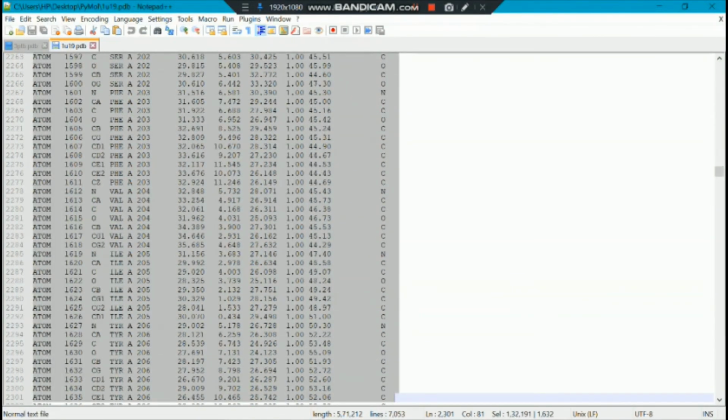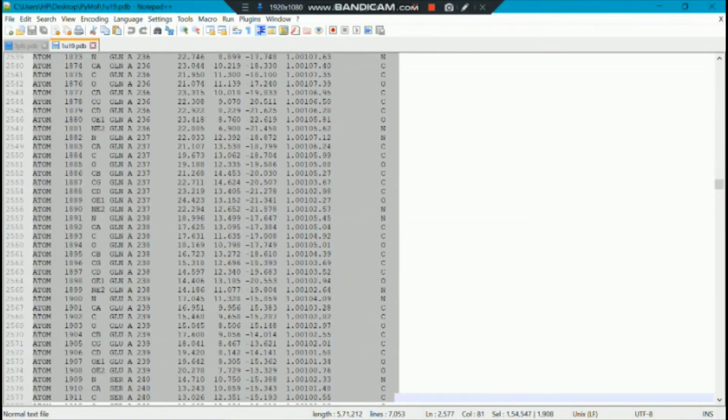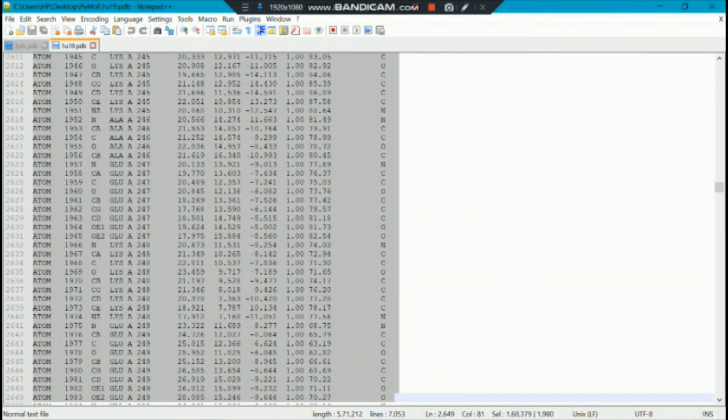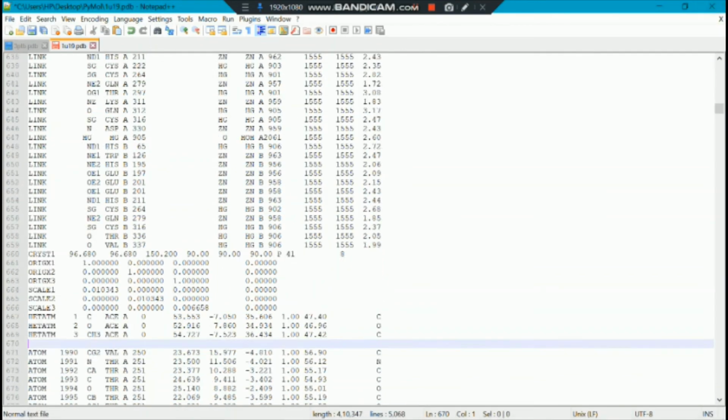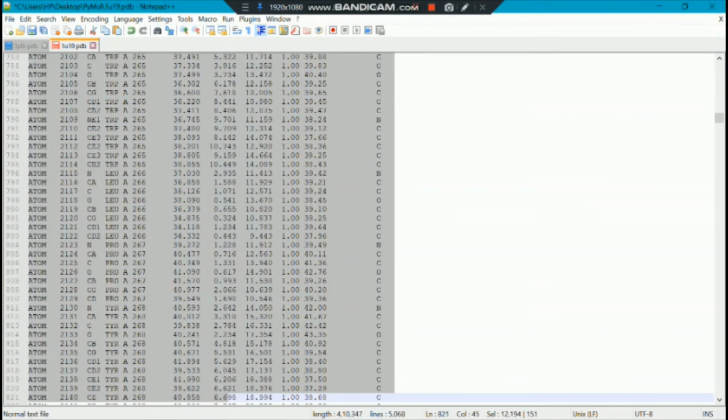So let us now delete this. We would select it and find the termination line, which could be written by a TER word, right?